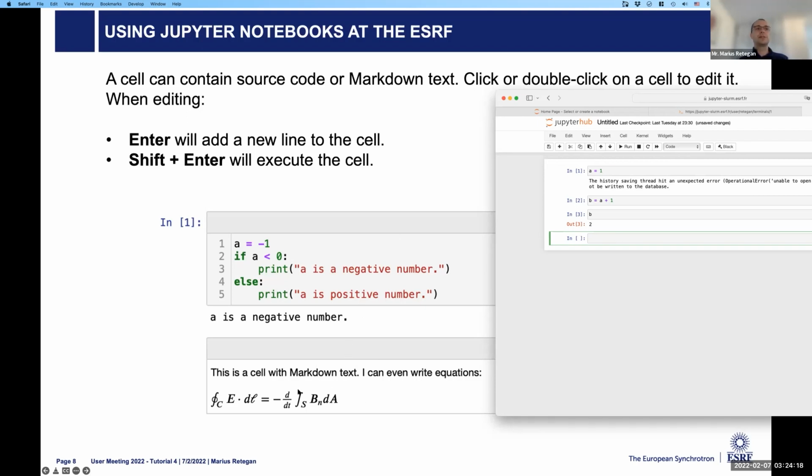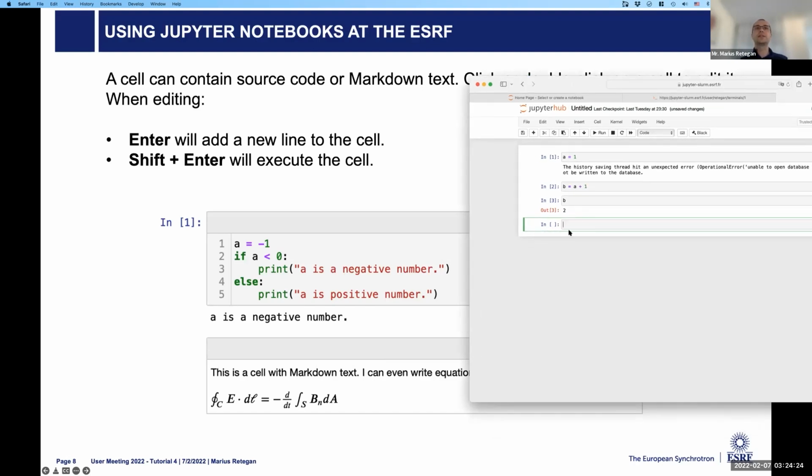Then you can also type mathematical equations. In this case, by default, as I said, this cell is considered code. But you can go to Cell, then Cell Type, and say Markdown. Now, if I type, this is markdown. This is just a name, like LaTeX. So this is markdown. You see, you don't get any reply, and then you write math using dollar signs. So, for example, alpha. Okay.